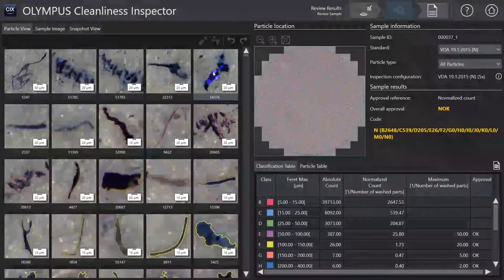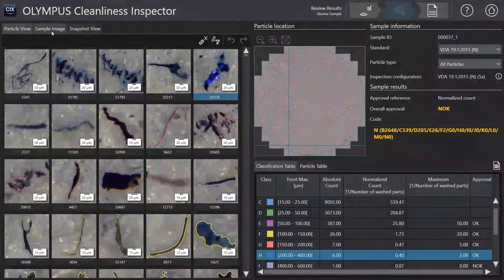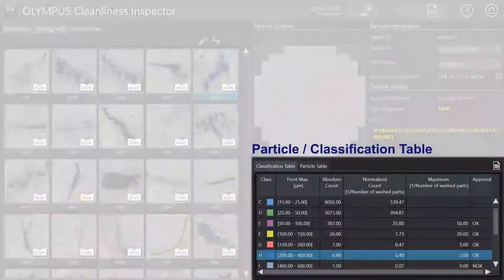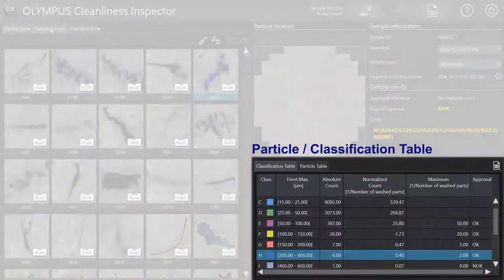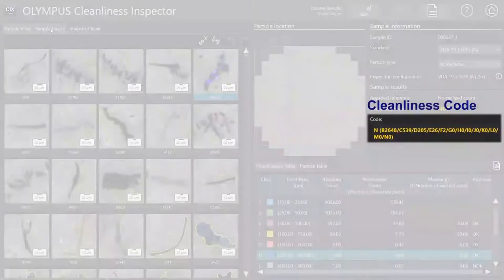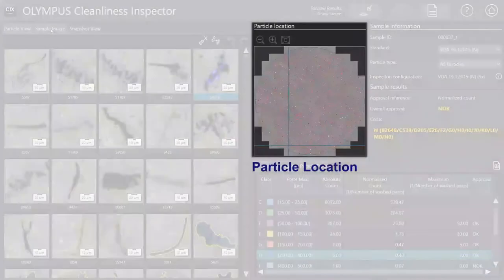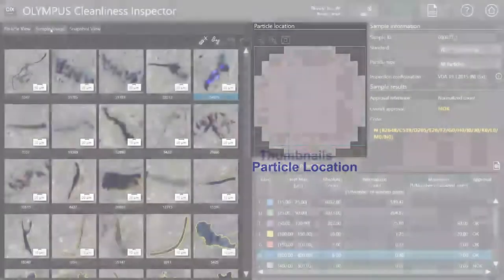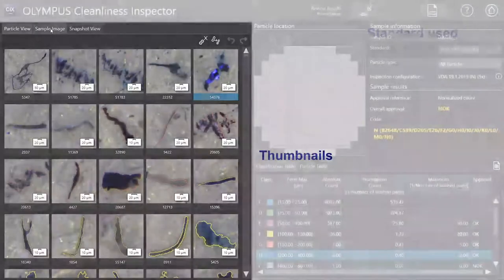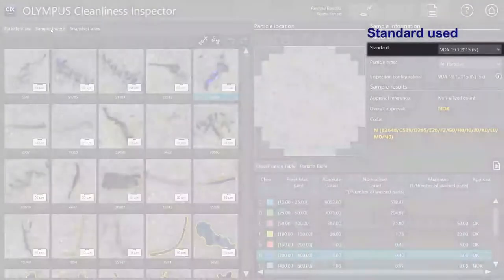For deep data insights, all particles and classification tables, overall cleanliness code, particle location, thumbnails, and the standard used appear in one view.